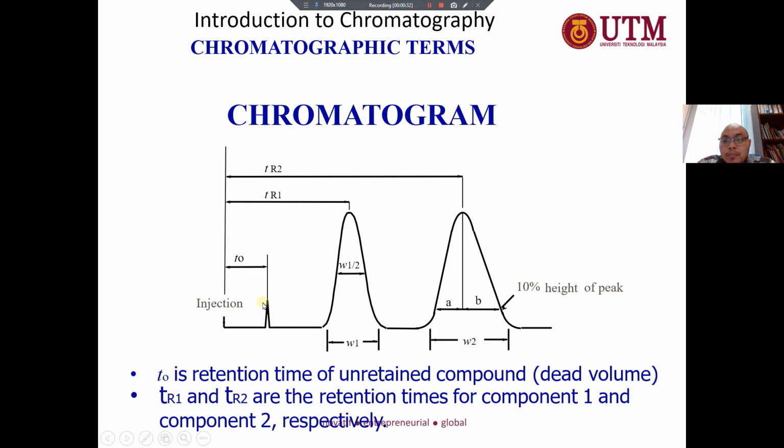It is the compound that does not interact at all with the stationary phase. So it will move with the movement of the mobile phase.